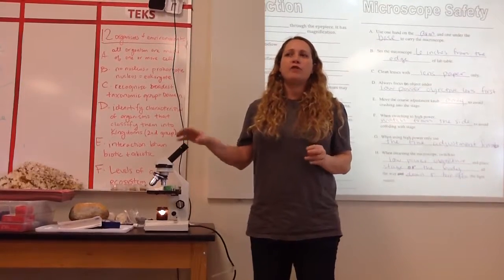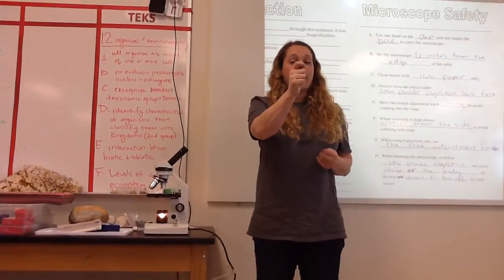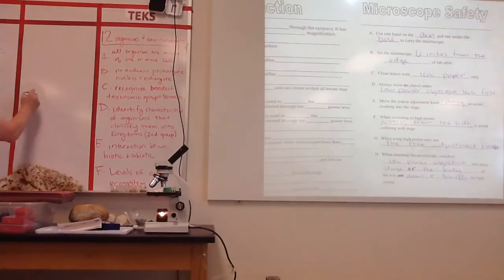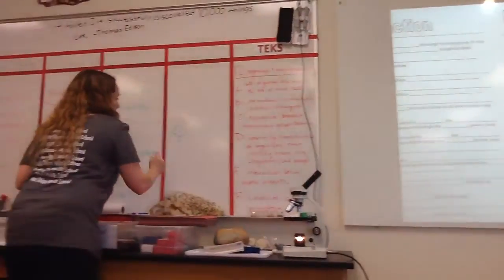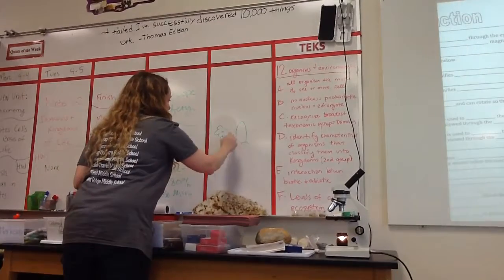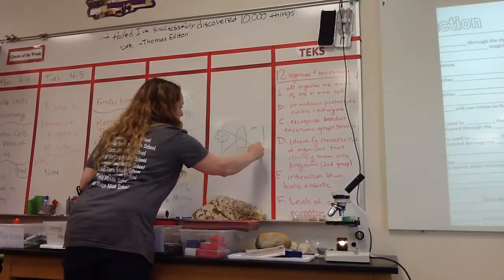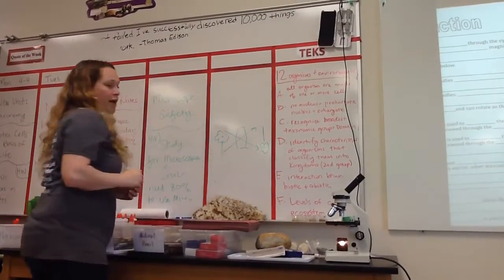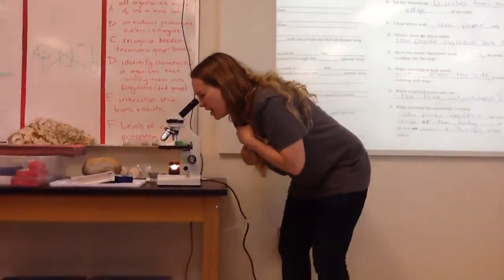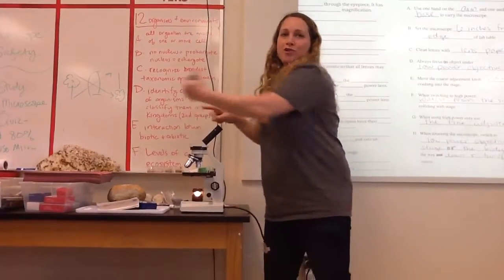It's kind of like, have you ever looked at yourself in a spoon? What do you look like in a spoon? Upside down. And that's because the images flip. So if it's a flower, and you look through a lens, then this part goes right there, that part goes right there, and you end up looking like the flower's upside down, but it's really not. So when you're looking at the image and it's looking flipped, you think you need to do one thing, but you actually need to do the opposite.